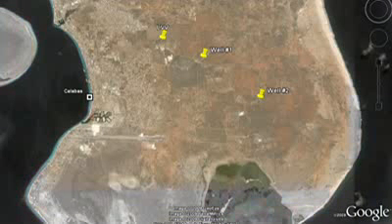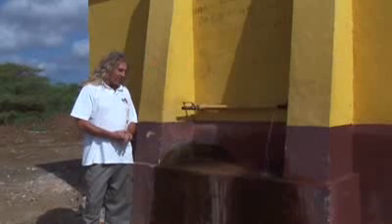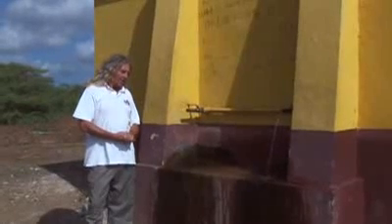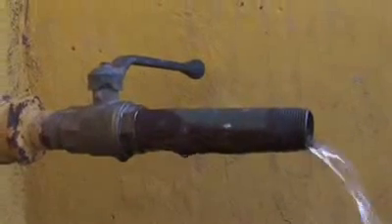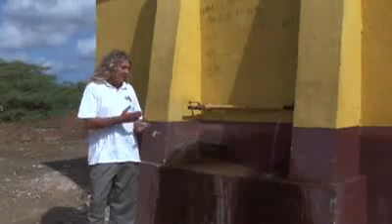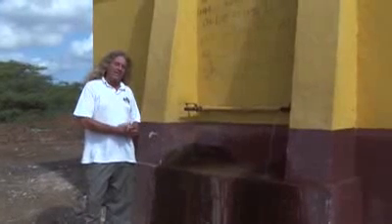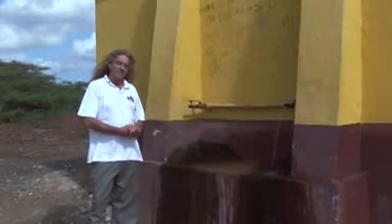We're back at this well. The water's running to make sure that we get a good flow, nothing that's been standing in the pipes. And we're back here because of the devastating results of the first test, which showed that there's enterococci, which means there's a clear case for leaching and contamination. Dr. Peachy will now take a second sample and we'll verify our results. And I have to say, this is really devastating.